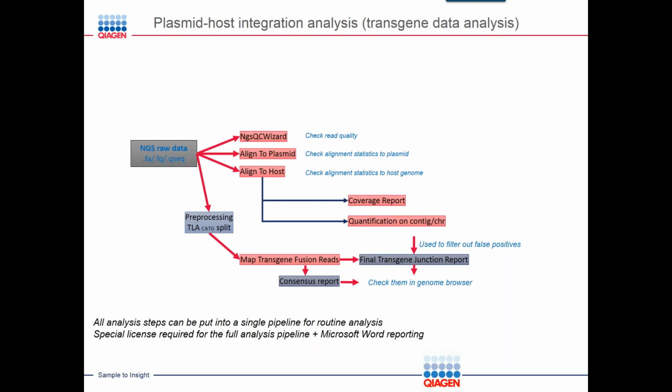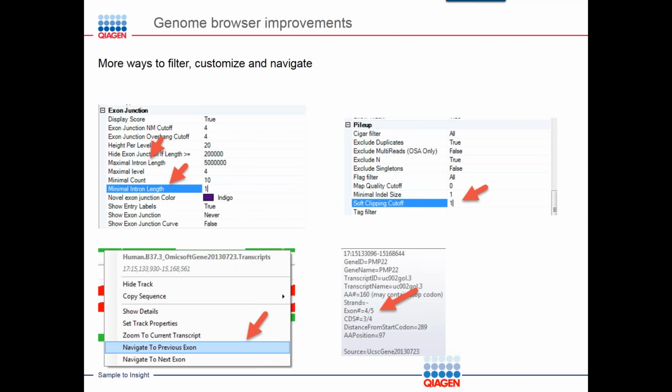And we provided a lot of novel technologies, which are only useful for this analysis, such as circular alignment, cross-species fusion analysis, and consensus analysis based on those unaligned reads. It's really a huge amount of work from the Omicsoft analytic team, and the analysis works so well that we think it's going to completely solve the problem. This one does require a special license. So if you're interested, please talk to Matt or the QIAGEN sales team and talk about the capabilities of this particular analysis.